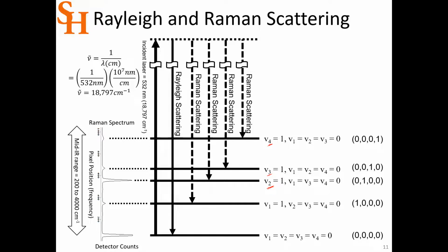I've also had some mercy on you. I did the first 3 simulated ones just to show you how to do it. You do the 4th, okay? And that reduces the tedium quite a bit. Instead of typing in 30 peaks for chlorobenzene in the infrared and 30 peaks for the Raman, I did that for you. I'm asking you to do the 5 or 6 that are active for benzene. So that'll get you the idea of how it's done, taking output from Gaussian and putting it into Excel.